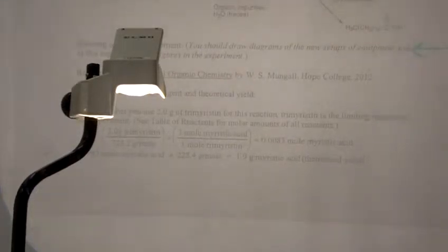And then make sure you show the calculation of limiting reagent and theoretical yield, and make sure you understand this calculation. Okay? It's really important for writing up your report and doing the calculations for your experiment that you understand this calculation. We're not going to go through this specific calculation, but go through the information that you need in order to understand this. So make sure when you're putting things in your pre-lab that you understand those things. And in a little bit, we'll look at those flow diagrams in a little more detail.